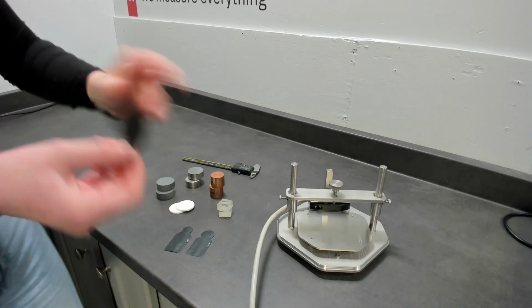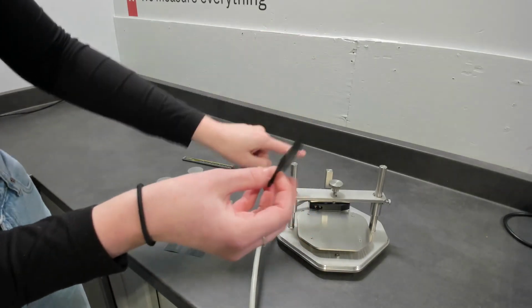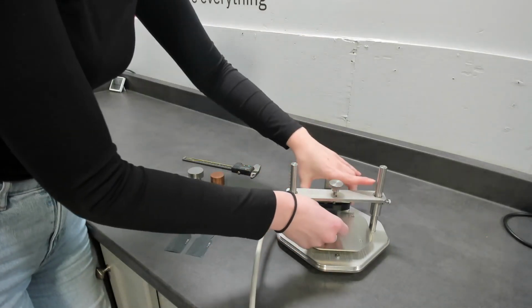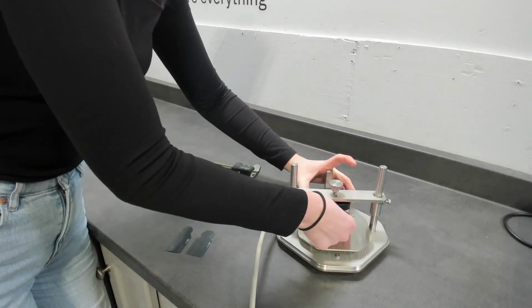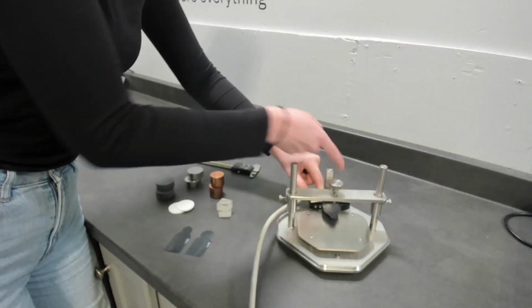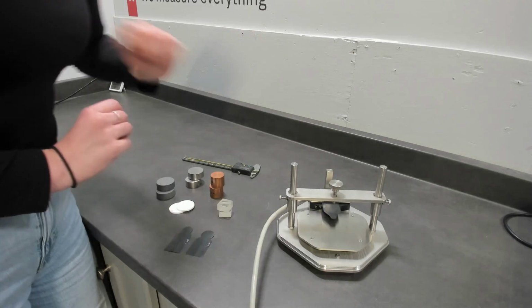So we'll just take our 2117-1 sensor and connect to our TPS adapter, aligning the brass contact points on the back of the sensor with the contact points on the adapter. And securing it in place to ensure good contact between the sensor and the TPS adapter.